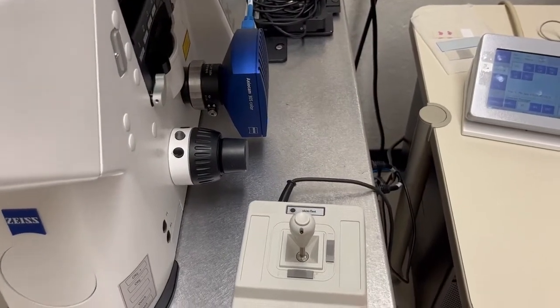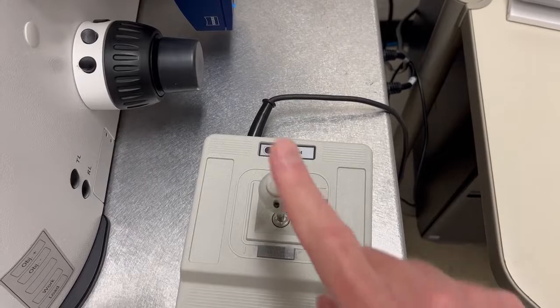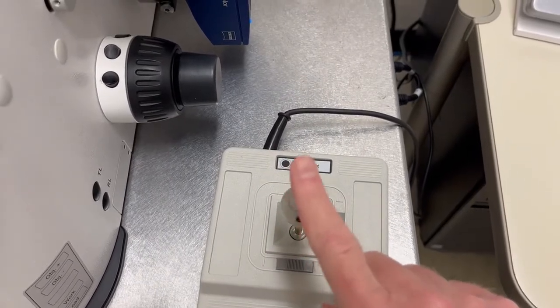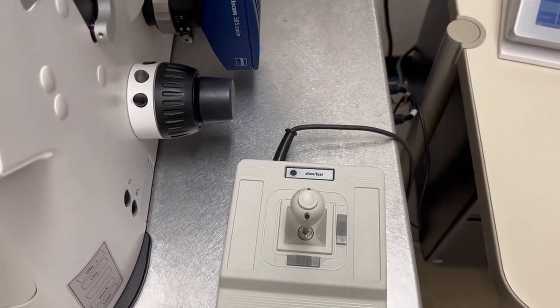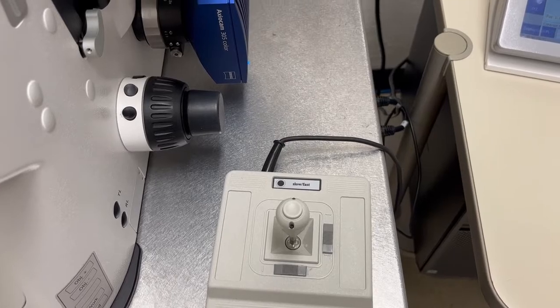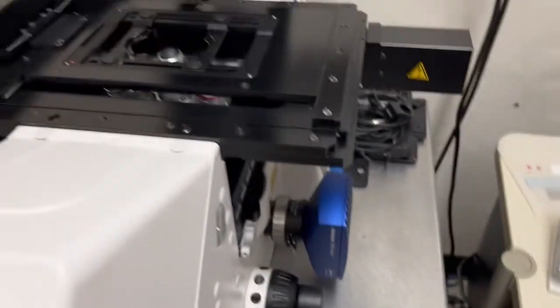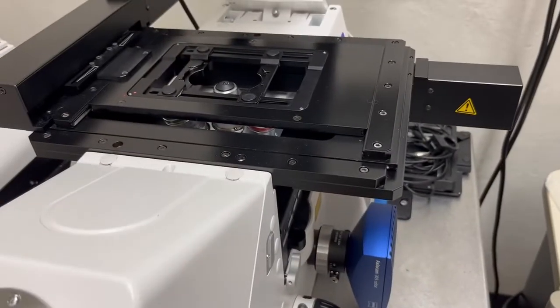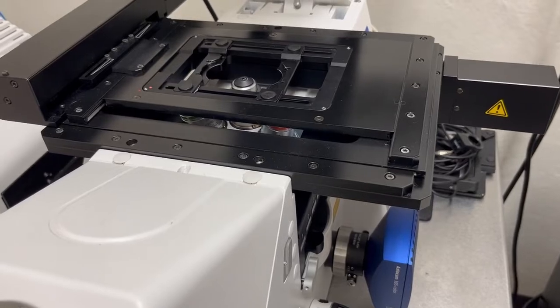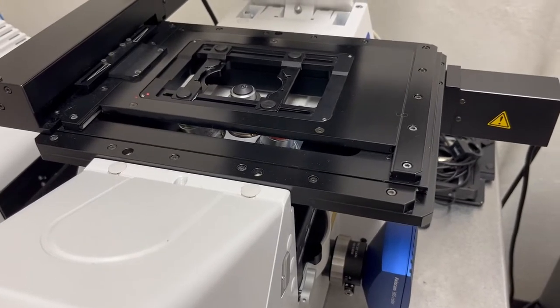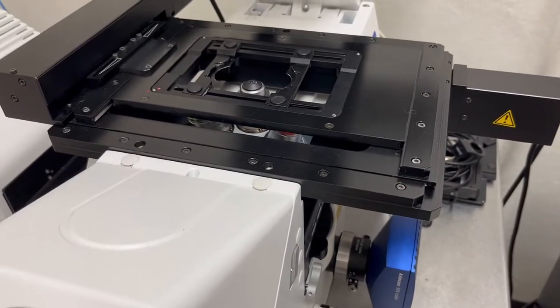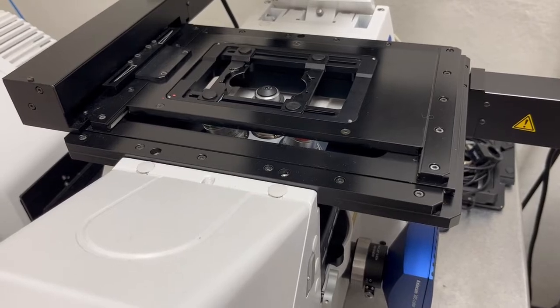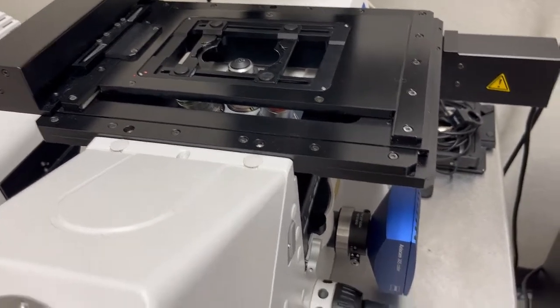And the joystick has two modes, which are slow and fast, and you can toggle between them by pressing this button. And keep in mind that how fast the fast goes depends on the objective. So if you're on a very low mag objective, the fast will go very fast. If you're on a higher mag objective, it won't move as fast across the full travel range.